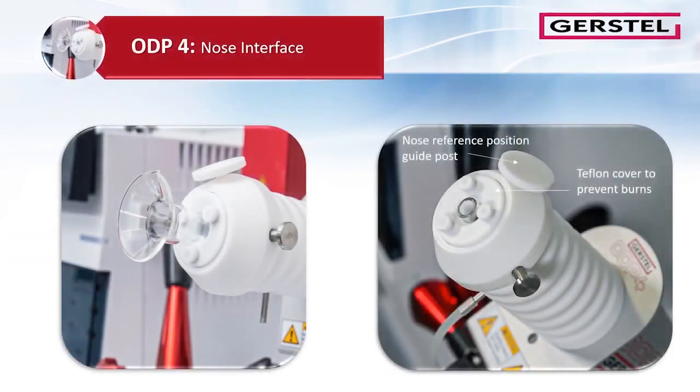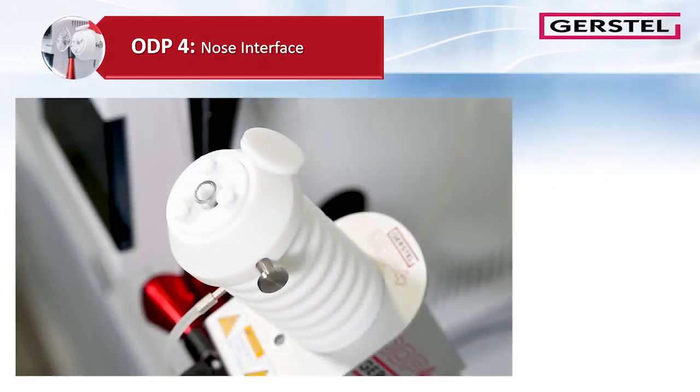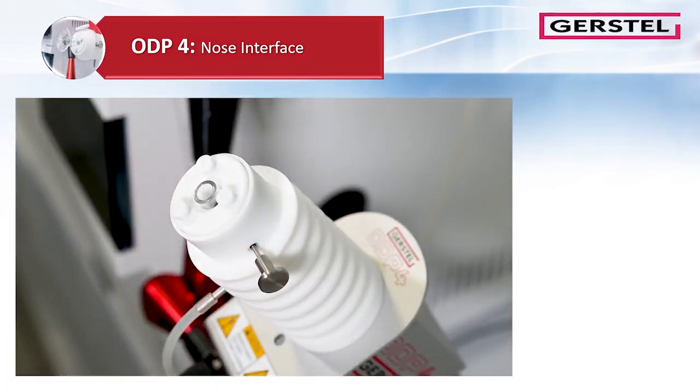The right adapter for every nose. Depending on individual preferences of the analysts, different setups can be used. In the right configuration, a guidepost is provided so that the analyst can place their nose at the same position each time. All configurations ensure an unretained release of the components to the nose, even with difficult analytes, as shown here in an original chromatogram. The ring and guidepost are easily replaced so that each analyst can have their own personal interface.